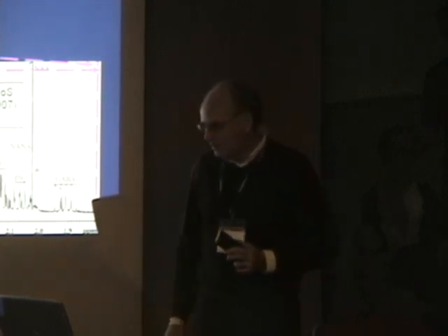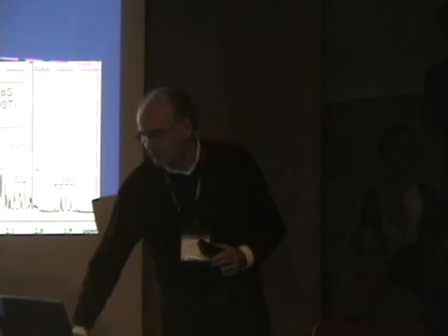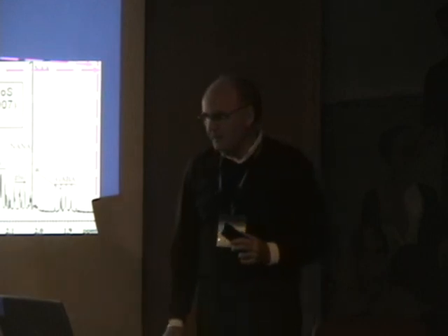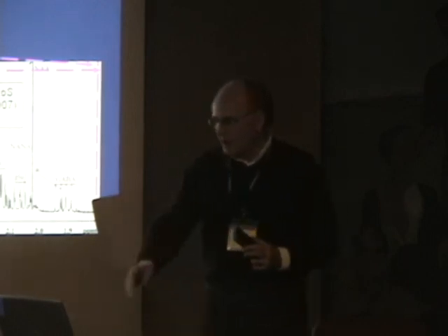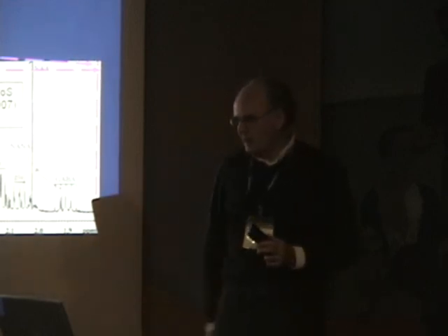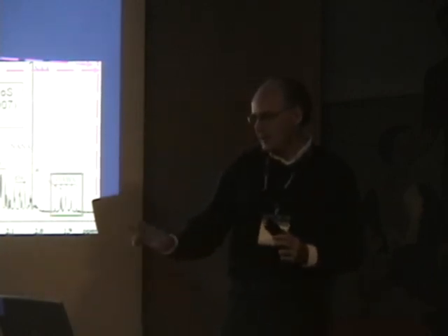So it's a very good resolution. You see a lot of details. Let's look at two regions. This region, for example, the right flank of the NAA peak. In vivo, you hardly see some broadening, a broad base of the NAA peak, basically a shoulder on the NAA flank. If you look at the same region here, this is the same green spectral region.